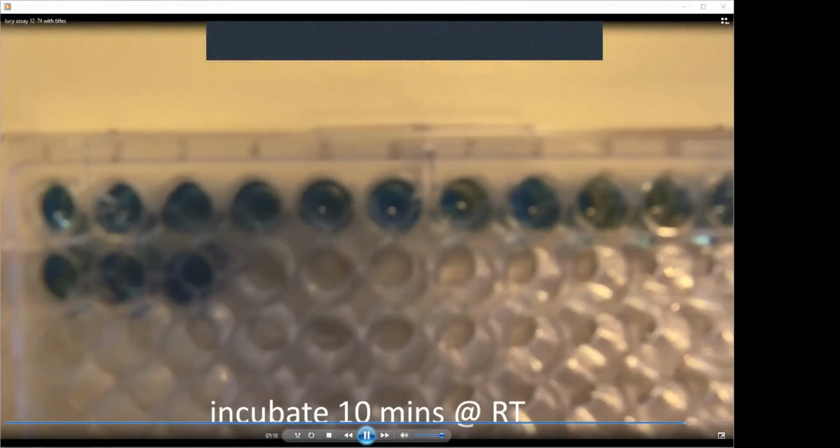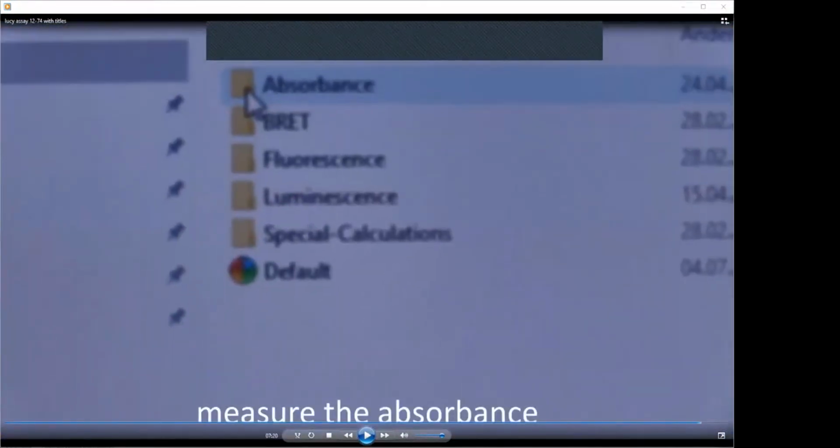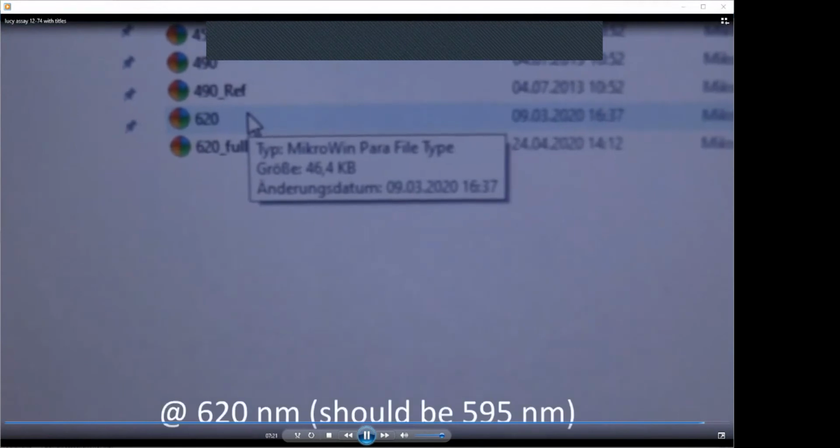But as a matter of principle, you can see that after 10 minutes of incubation, there was an obvious change in color from this brownish to blue. And then it is used for the measurement of the absorbance using the same instrument, but in this case, the algorithm is for absorbance, and it is at 620 nanometers.